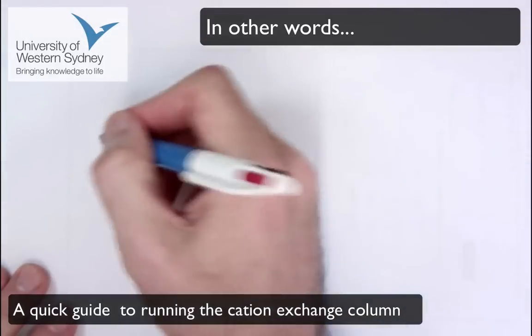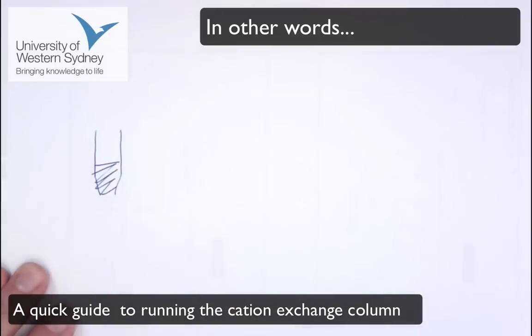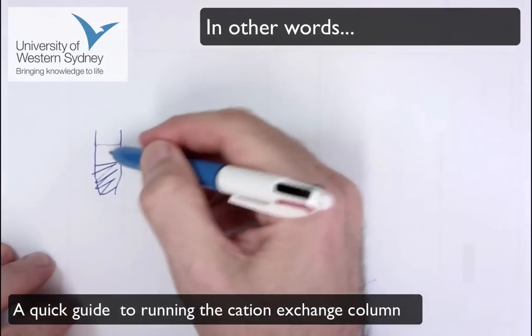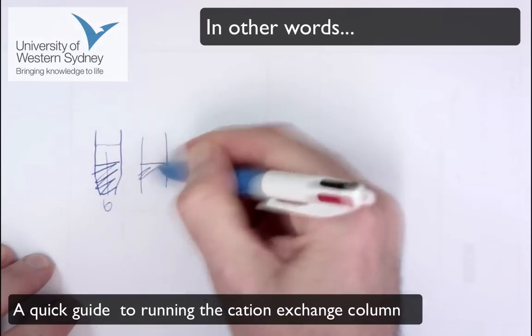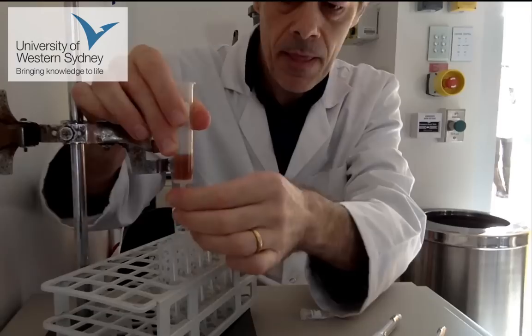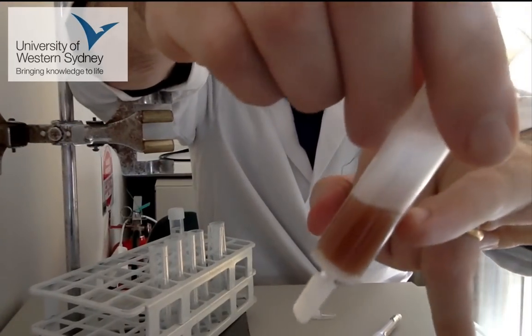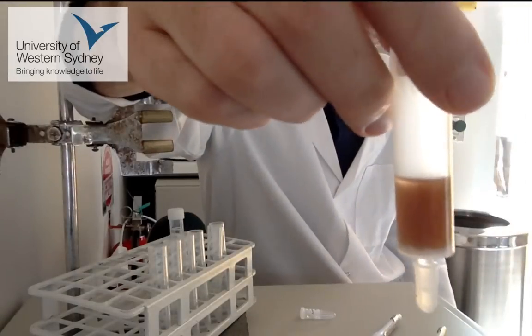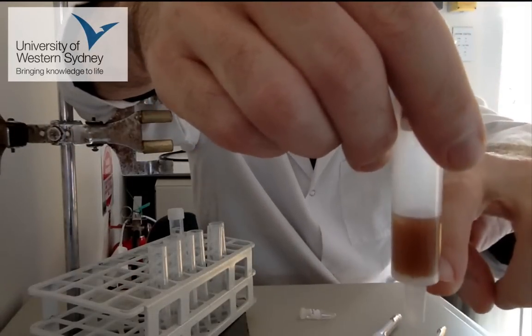So what effectively you're doing, you've got a column with your matrix, okay? It comes with a bit of buffer on there already, and you run that buffer through the gel to give you your matrix with a meniscus. Now, it's important when you do this that you don't let that little bit of buffer on the top there sink into the column. That's the key thing which will spoil your results. So never let the top of the column dry out, all right?